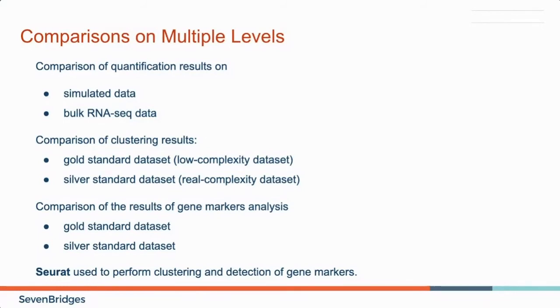And since the ground truth information related to this dataset is obtained using a different approach that is less reliable than used for gold standard dataset, this one is labeled as a silver standard. So we'll present the results for the silver standard dataset because they are more divergent and provide better insight when estimating precision of these tools.